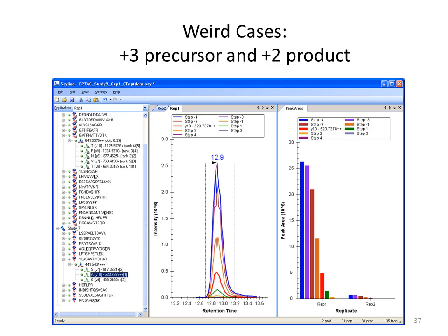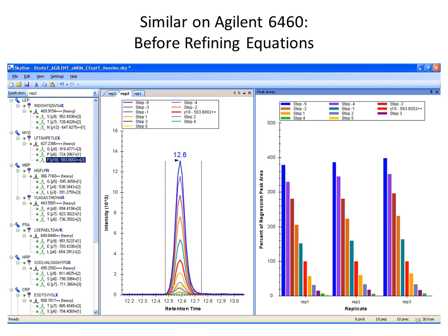Now that's an intensity improvement that I would totally change my collision energy for, but it can't be predicted right now because it's based on the product ion mass to charge and charge, not the precursor. Brendan and I have spoken about this, and if I can get him enough data and we can model it, then there is a chance that we can get product ion level collision energy equations to work. And this happens on all triples. It's an ion physics thing, not an instrument thing.